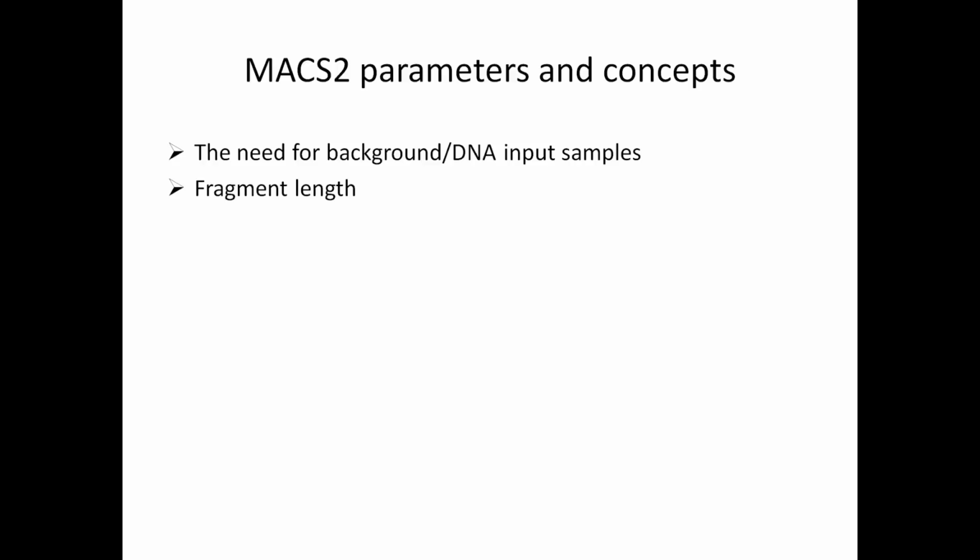And this is most likely to be where a transcription factor binds to the chromatin. MACS2 now uses a method called strand cross-correlation that relies on forward and reverse reads clustering in areas of binding.